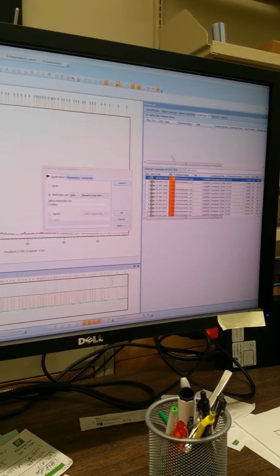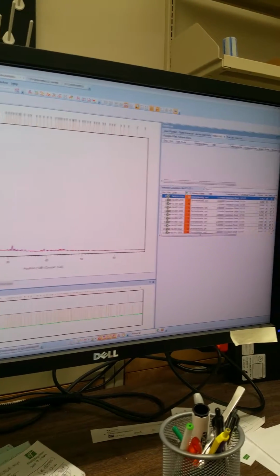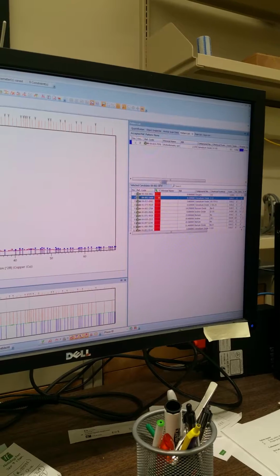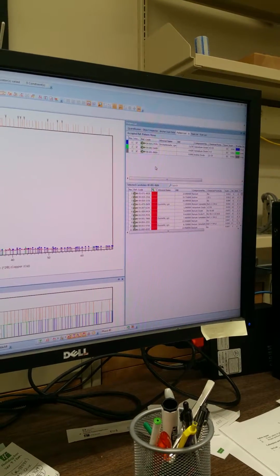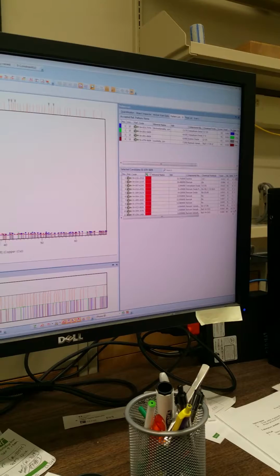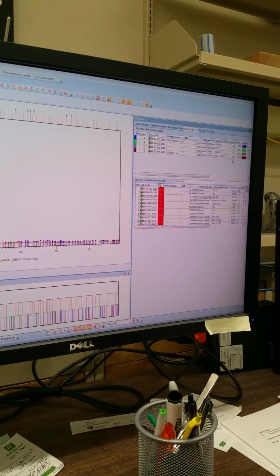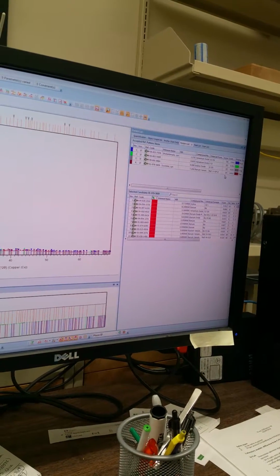So it found vanadium oxide. You have to click OK here. Vanadium oxide, and then you have vanadium oxide in another phase. You have iodine oxide. You have barium 3 vanadium oxide. So depending on what you have, you're going to get a score. The bigger the score, the better the matching of the phase that it has in its library with your material.